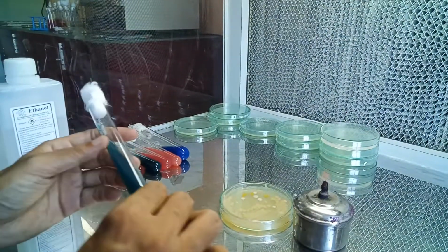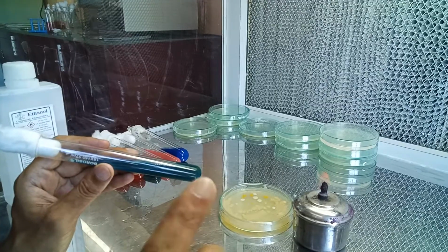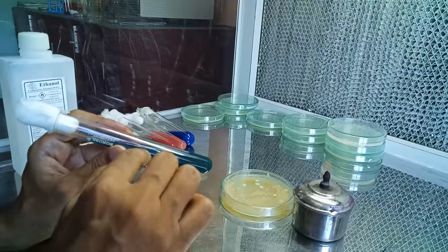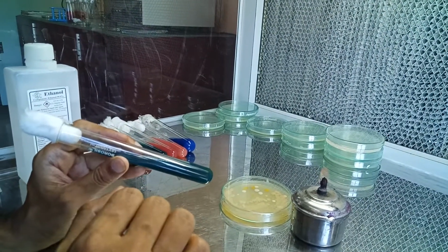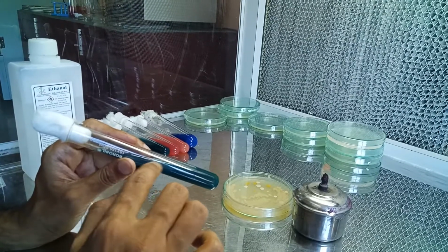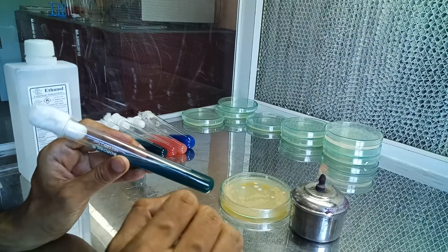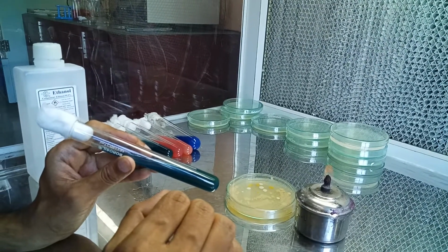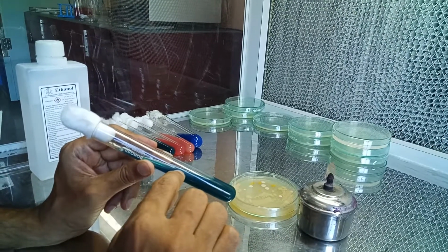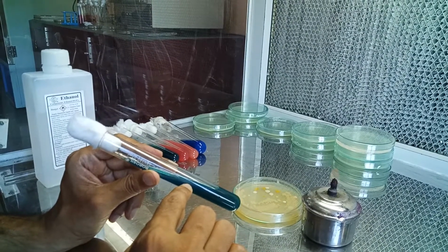So we use Simmons citrate agar over here, wherein we have citrate or citric acid as the sole source of carbon. So only those bacteria which are capable of utilizing citrate as the sole source of carbon will be growing here. And when such bacteria grow on Simmons citrate agar, it metabolizes the citric acid, and through intermediates it leads to production of pyruvic acid and carbon dioxide. So the carbon dioxide produced thereby reacts with sodium and water, and that produces sodium carbonate.